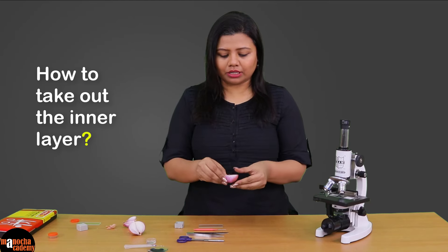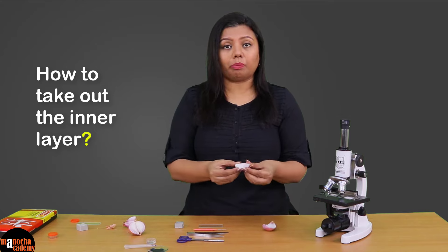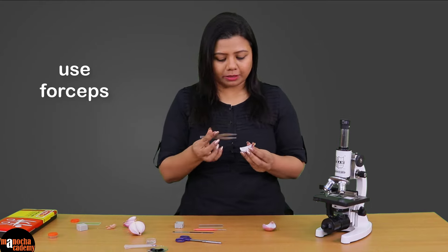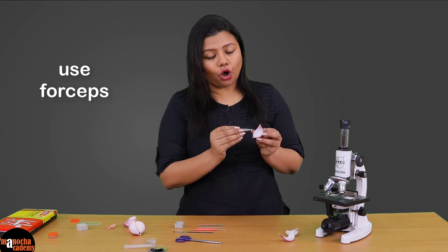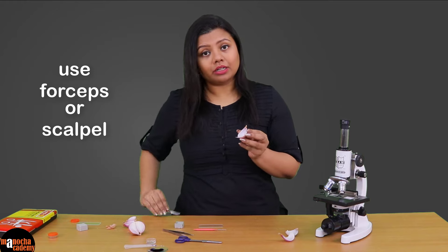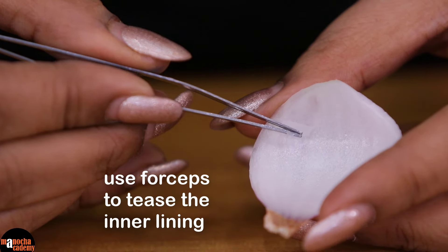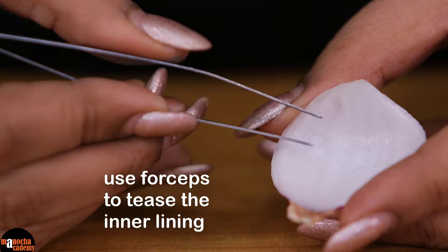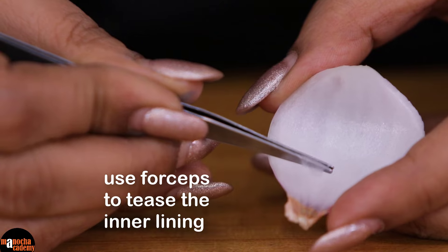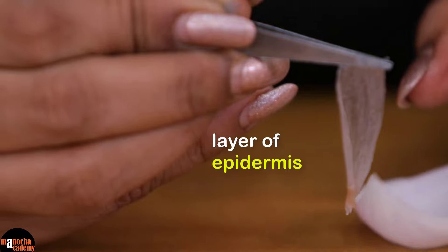How will I take it out? I break this into a small portion, and then with the help of a pair of forceps I will just tease the inner lining of the onion peel. You can also use a scalpel here, but forceps is always very convenient. You just have to tease it and you will see the inner lining coming out like a thin strip. This is the layer of epidermis that we require.